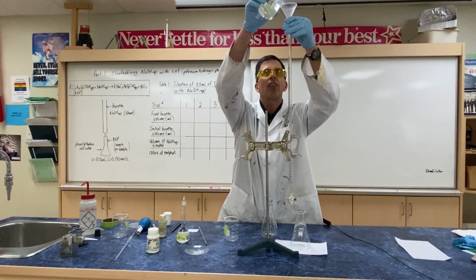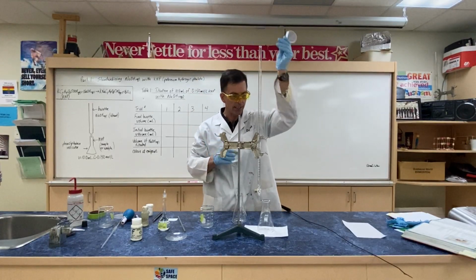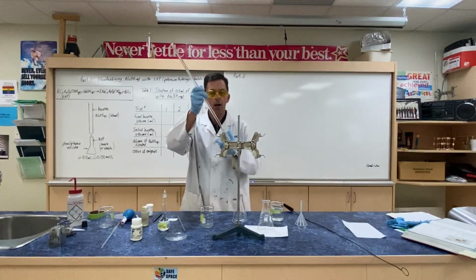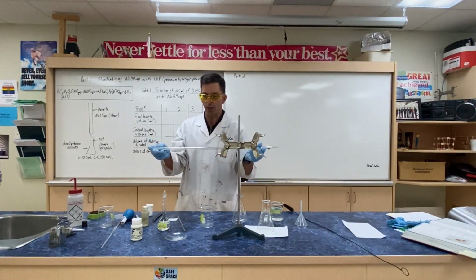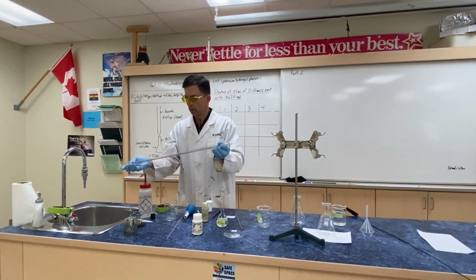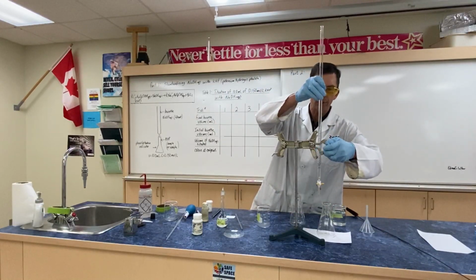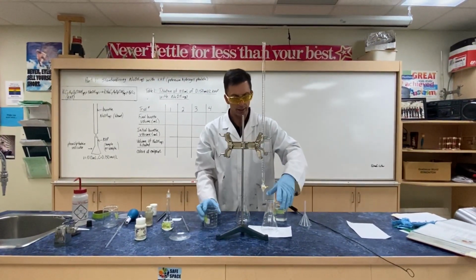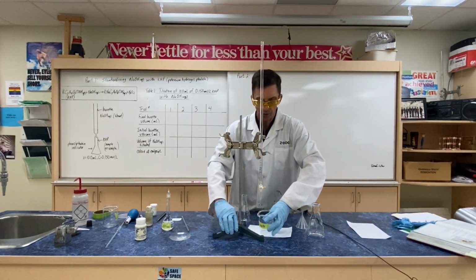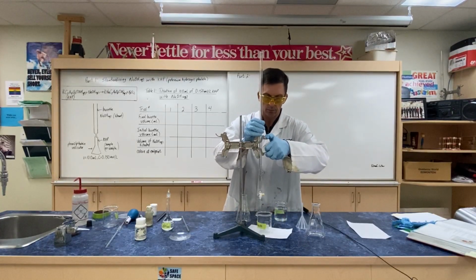Yeah. Then what we want to do is rinse the burette with the titrant, and this should actually be done 3 times. Off camera, I have done this twice already. So just rinsing this into the sink a little bit, rinsing the stopcock into a waste beaker. Make sure that all of your containers are properly labeled so there's no confusion and no errors that way.